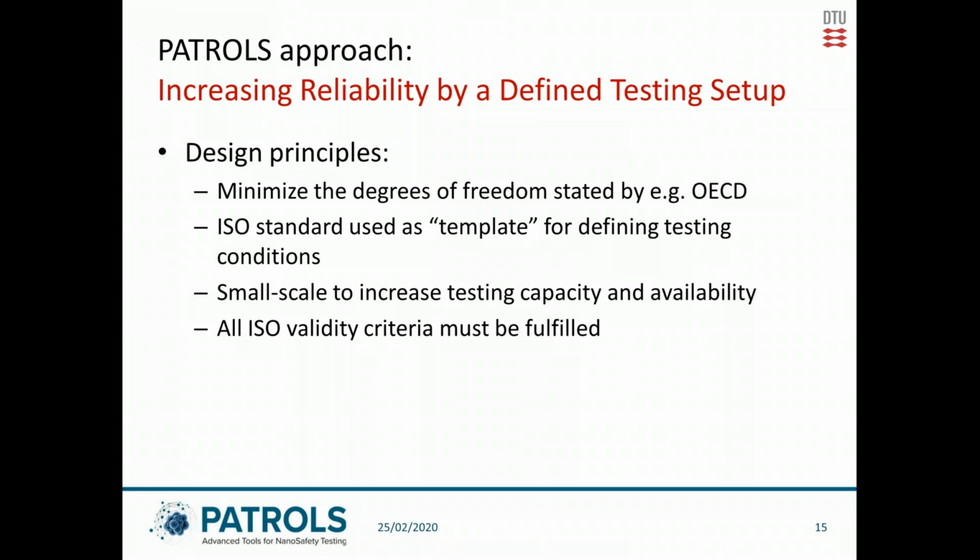conditions. We have a design criterion that it has to be small scale, but not mini scale. We want to increase the testing capacity and availability, but we can't go all the way to micro scale.